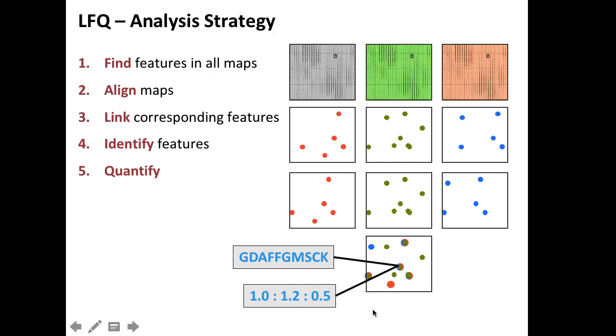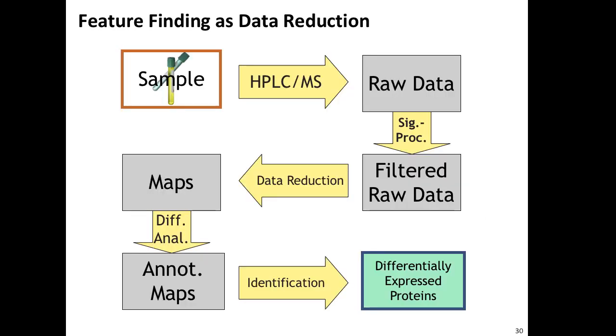And that is everything we need to do quantitative proteomics. Seems straightforward enough. When you think of this process as a computer scientist, then it is fundamentally a massive data reduction step. I mentioned that yesterday when I was talking about pipelines. A terabyte goes in and a spreadsheet comes out.